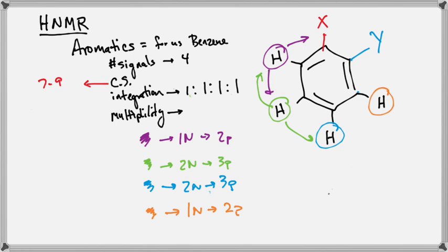That becomes a harder question because what we're trying to do is now predict what the spectra looks like. Where we start is we assume cleanliness and we go from there. When we look at spectra, you assume it's a mess and you go from there. Make sense?